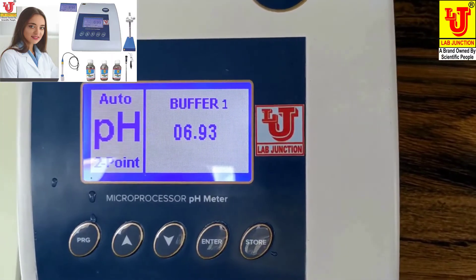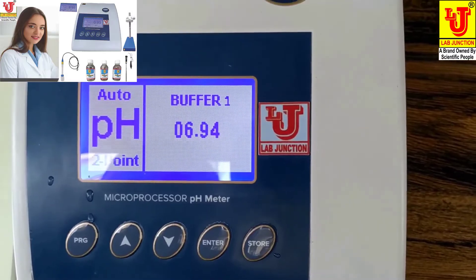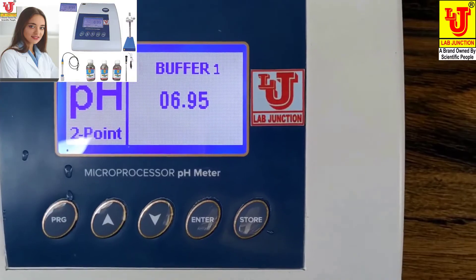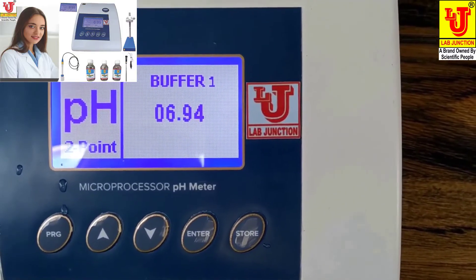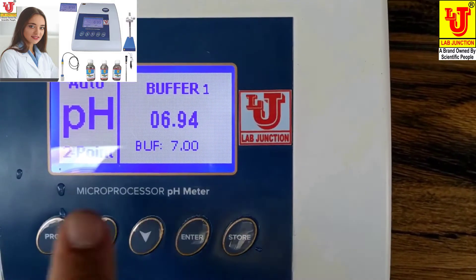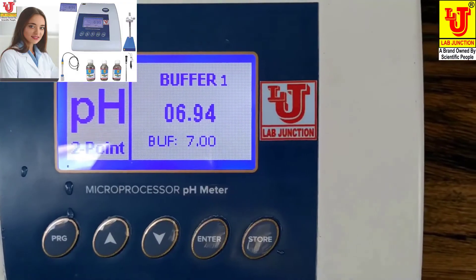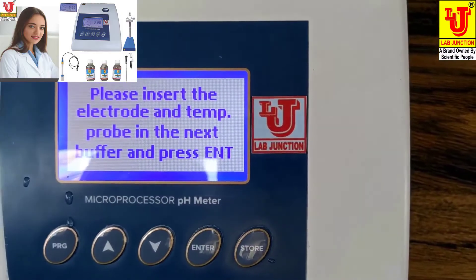Suppose it can achieve on 6.94. It is increasing, please wait for some time. You can press enter. It can calibrate buffer 7.00 automatically. You can press again enter.